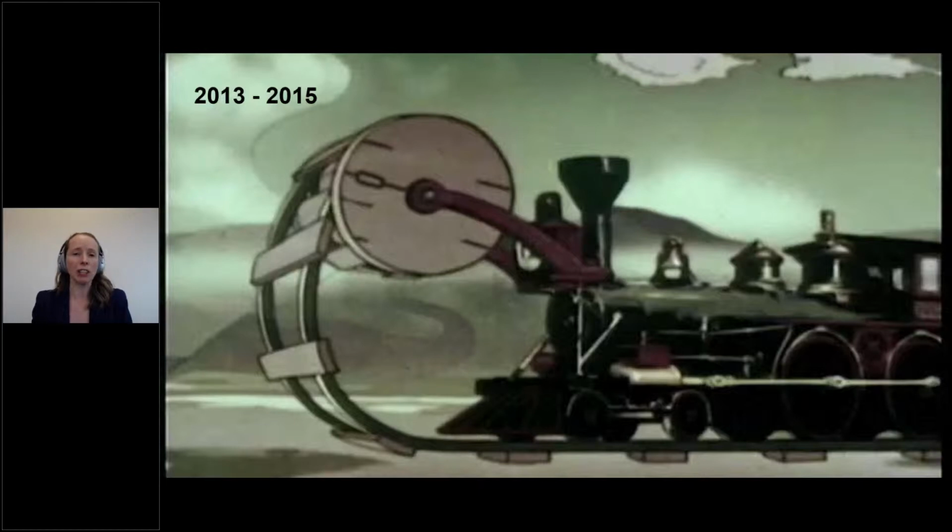I guess research can feel a bit like that when you're starting out and you're going a little bit blind, you don't know which way you're going. But in the clinical world, there's more disciplines involved. There's more different sets of people involved, and more processes and moving parts. So that's how it feels a little bit different. These prototype systems that we built focused on two key areas: the bioinformatics pipeline and the variant interpretation tool.